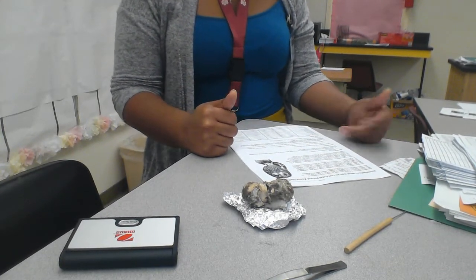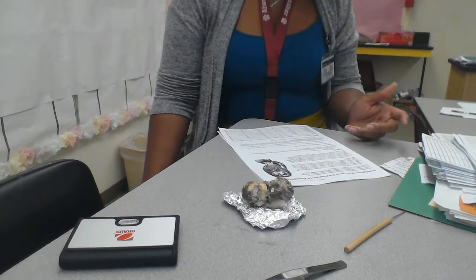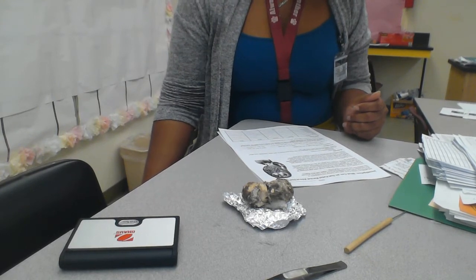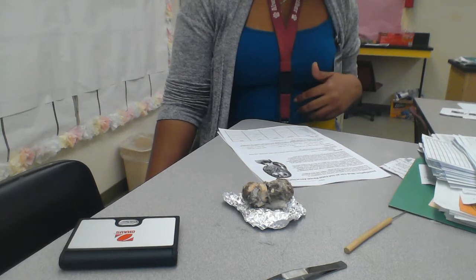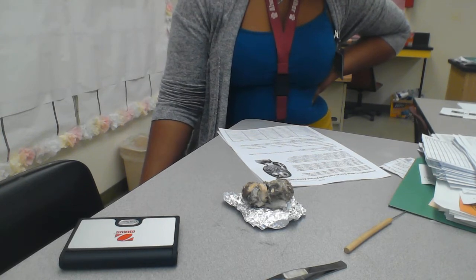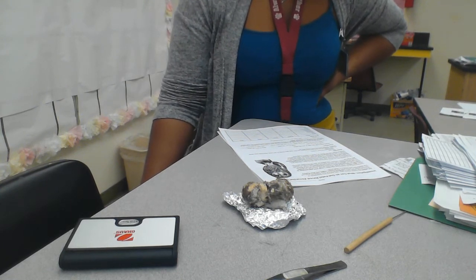All right? So, owl pellets are masses of bone, teeth, hair, feathers, and exoskeletons of various animals preyed on by raptors. Raptors are birds that prey. Pellets are produced and regurgitated not only by owls, but by hawks, eagles, and other raptors that swallow their prey whole or in small pieces. Owls feed early in the evening and regurgitate a single pellet approximately 20 hours after eating. All right. So, almost like how we digest our food.